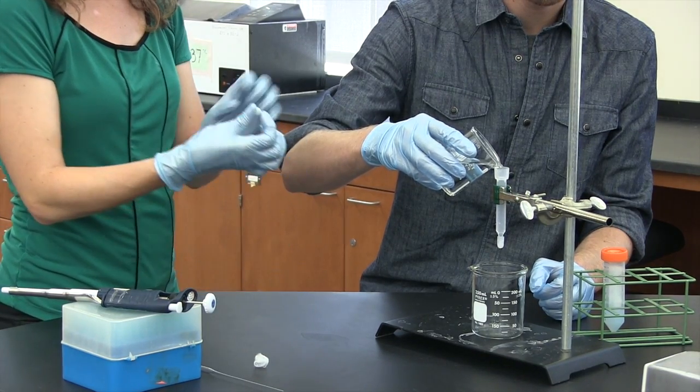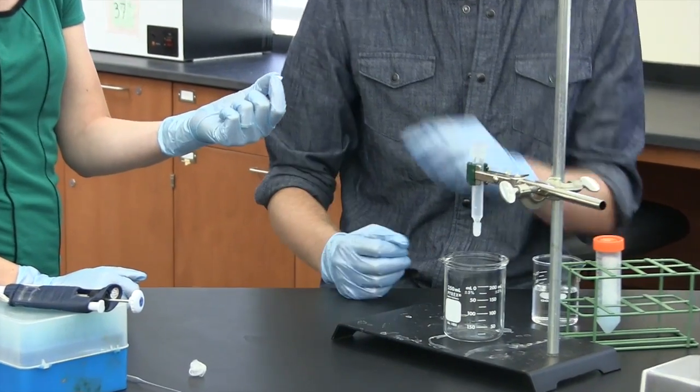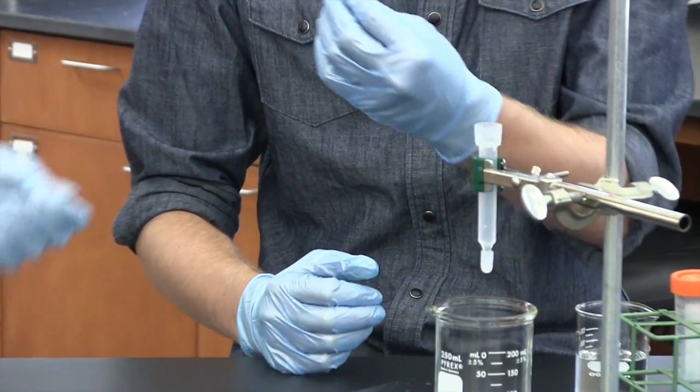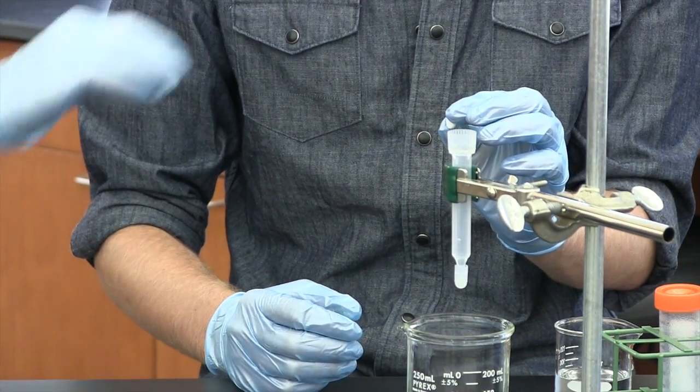We're going to add this little frit into the bottom, and that's what's going to hold the nickel resin into the plastic column. But before you put it in there, you need to make sure that it's wet and that there's no air underneath it. That's why you have to fill buffer all the way up to the top.